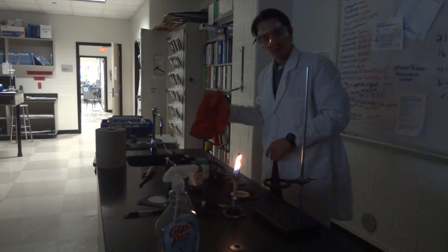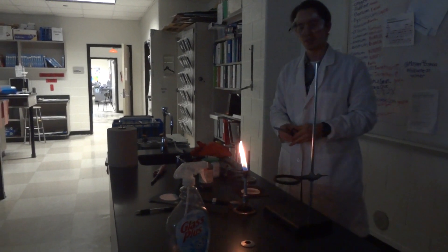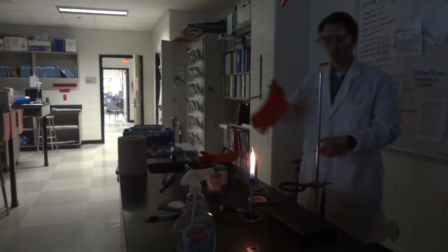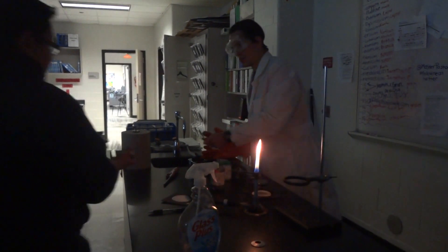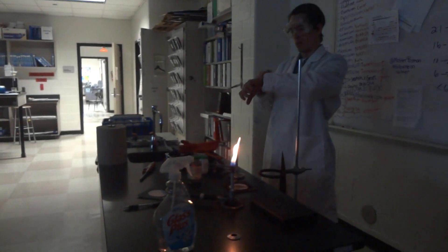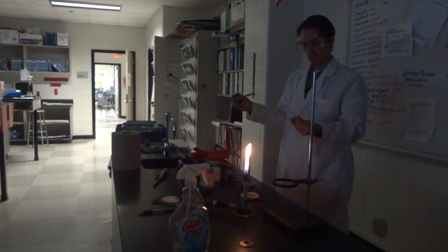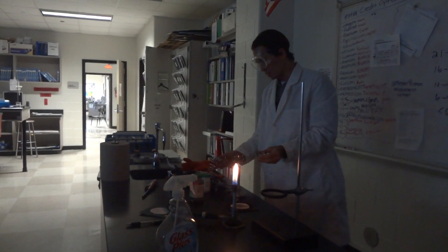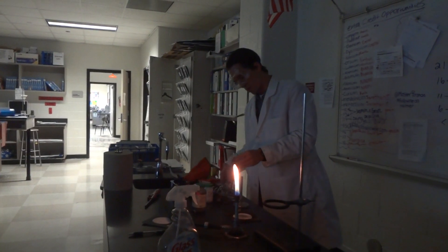Now we're going to try magnesium. What did we write down? Write what you observed — a little bit of sparks, not too much. Now let's compare that with magnesium. What do we know about iron? What kind of metal is that? Transition. Are transition metals reactive? Not as reactive. What about alkaline earth metals — are they reactive? Yes. Okay, so watch this carefully.